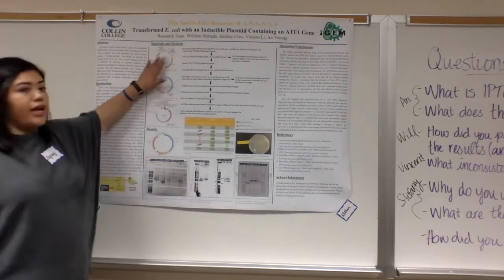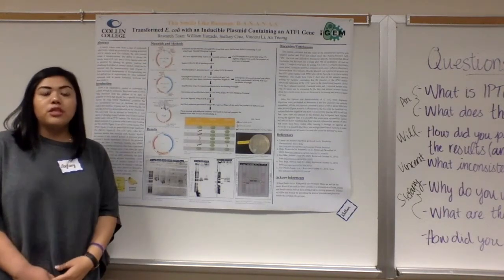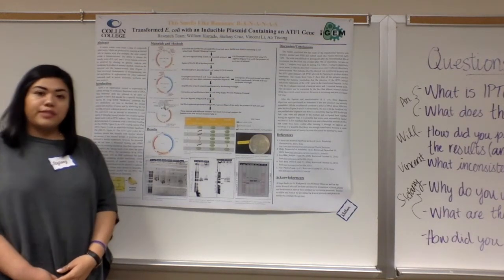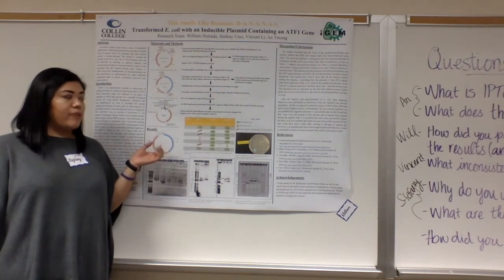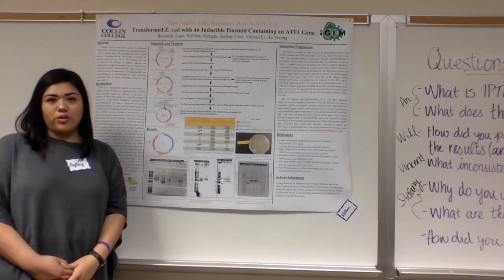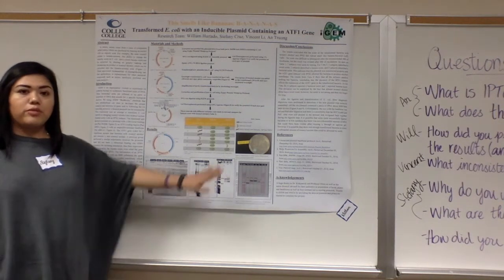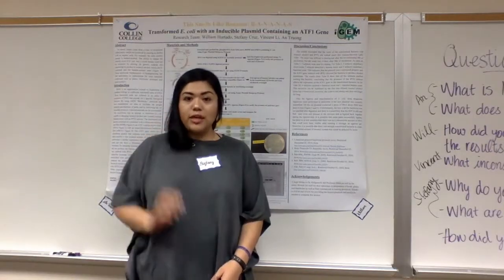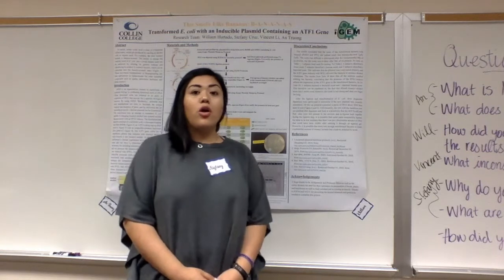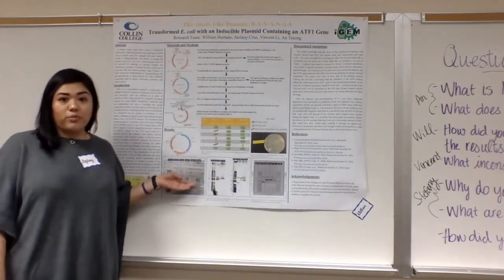Well, our part A and part B are in a chloramphenicol backbone. We could have used other backbones like kanamycin and tetracycline, which we did, and our kanamycin backbone that we originally used did not grow any colonies. And so we changed to an ampicillin backbone that resulted in growth of the transformed bacteria. Some weaknesses that we found throughout our experiment was initially we did not have enough concentration of our parts.